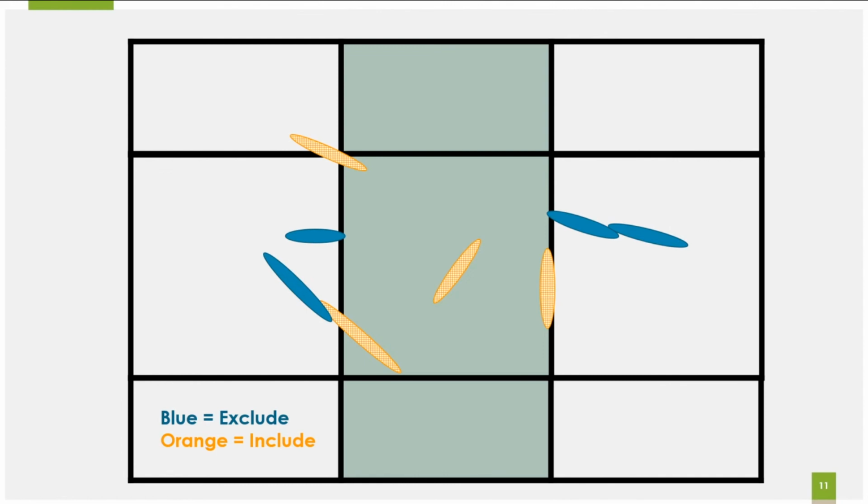That's also why on the slide before I say we're going to count 5 columns over, count this column. At least we can say we're all counting these grids the same way, counting the same number of columns. There's some consistency and some standard measurements to go against. So that's why it may seem so stringent, and why we're just trying to control for as many things as possible. This is just another example of one of those things.